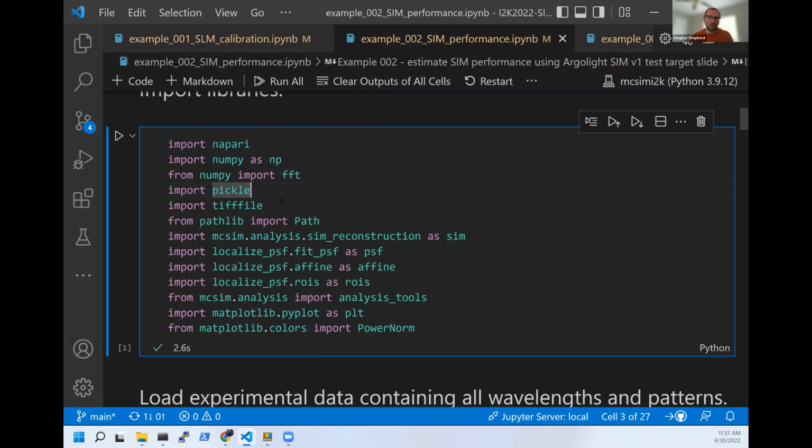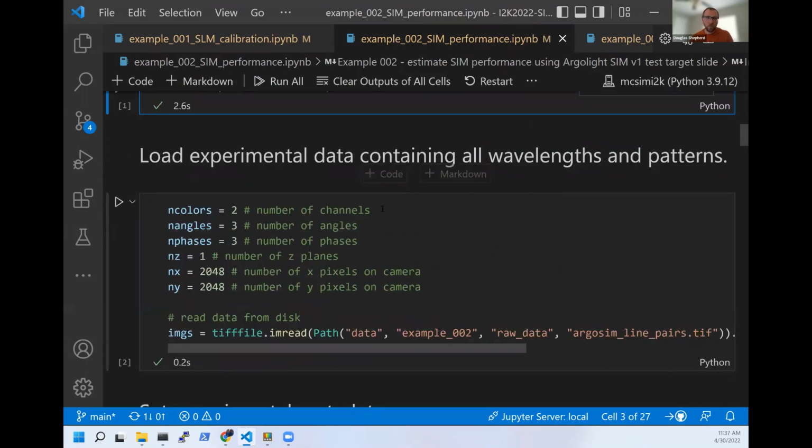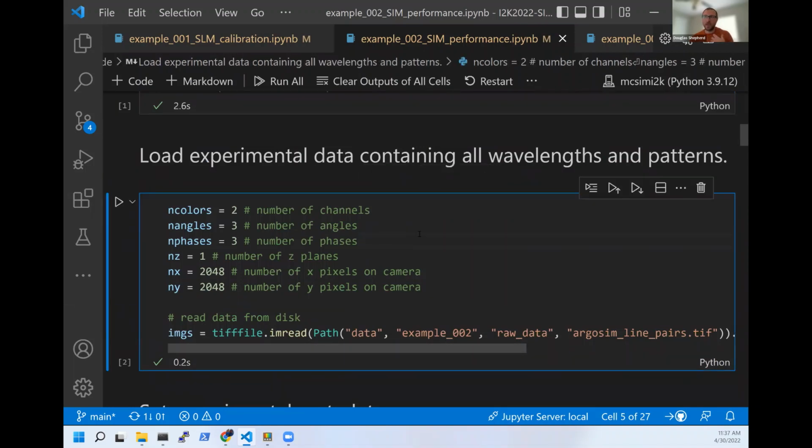This is just how we had originally started doing it for our affine transformations, because we're not typically sharing that information outside of the instrument. So then what we're going to do again is explicitly write the metadata down instead of dealing with automatically loading it from the instrument, just so that we get a real sense of what's happening here.